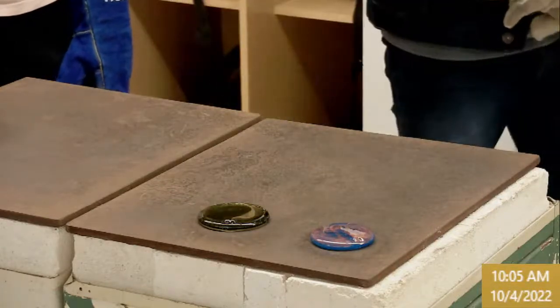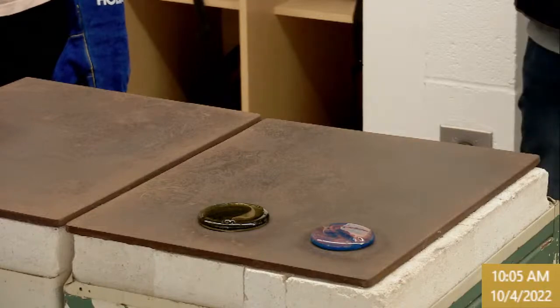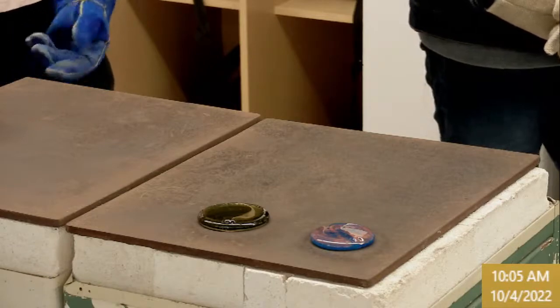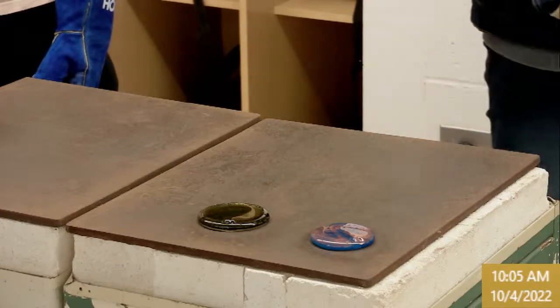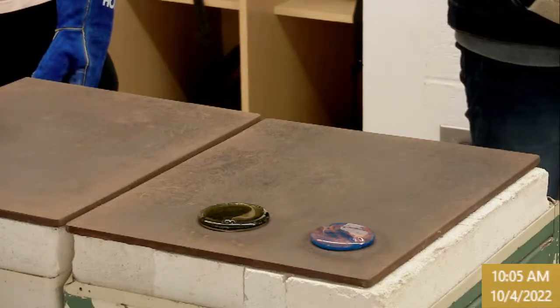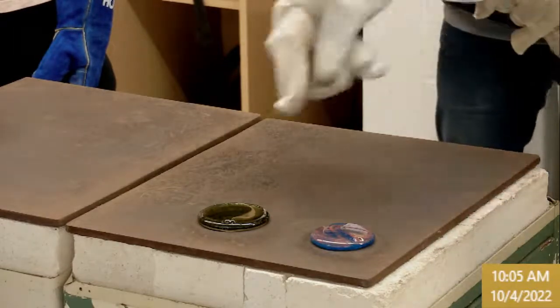So anyway, C2, that's a Mason sand, so that's a fairly high impure sand. They're like little pebbles, dark pebbles in that one. It's 40 grams Mason sand, 52 grams of a high purity Granusil, high silica sand. So it's going to be medium impurity there for that combo. 47 sodium carbonate, 25 crushed limestone with 0.09 chrome oxide. We're pulling from the middle. That chrome oxide should make it look green eventually.